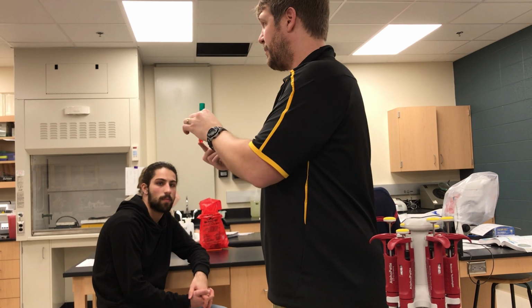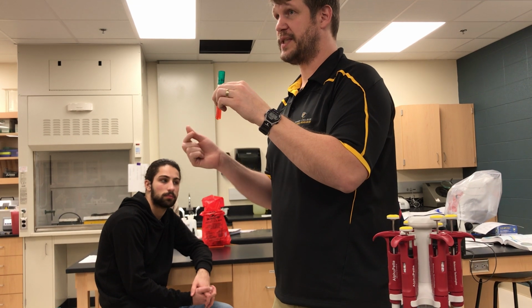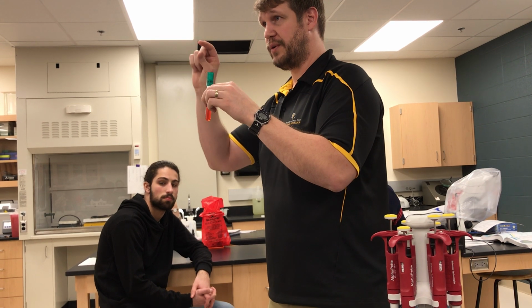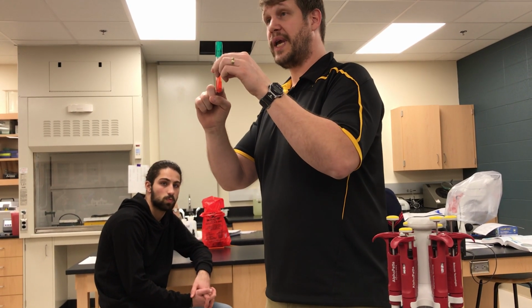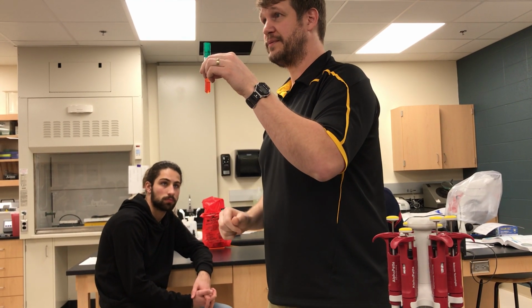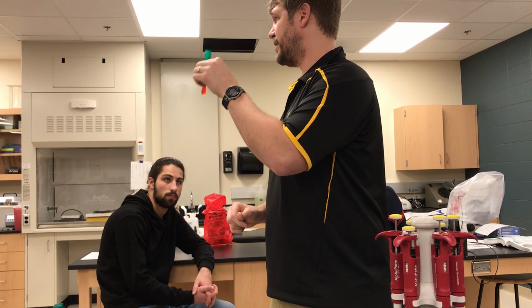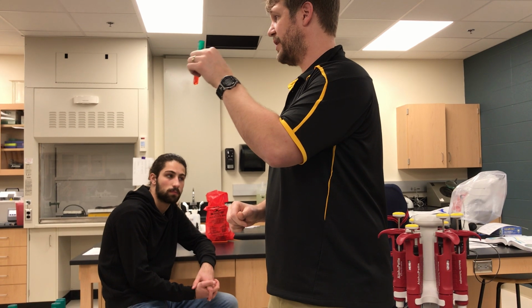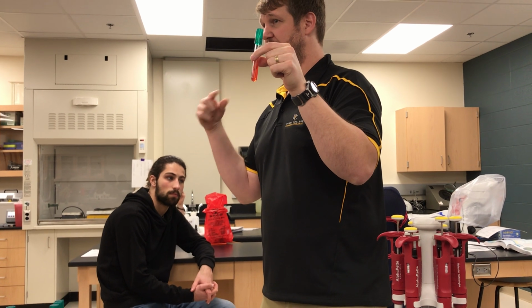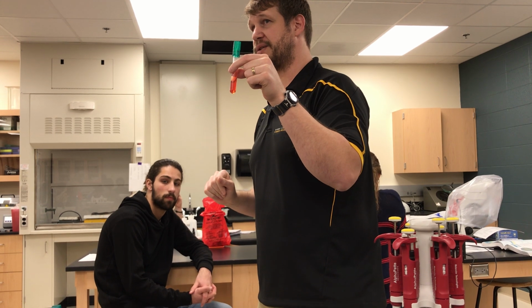And the other fun thing that happens is because you did a stab, if the organism is producing gas as a result of the fermentation, which we saw before as well with the phenol broth, you had the little Durham tubes that would float or would capture gas. If you get gas production in the media, it will cause the media to split or pop off from the bottom of the tube. Right? So Kligler's shows you a whole bunch of stuff about your organism all in the same tube. Now there's a lot that I just said to try and interpret that. Your laboratory manual actually has a really nice table that will guide you through that interpretation.